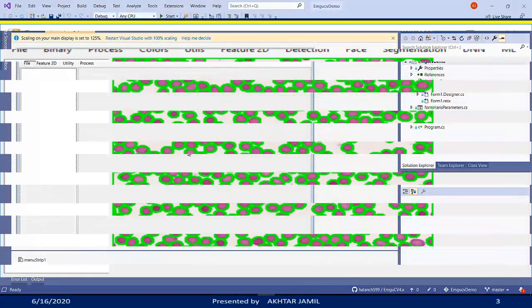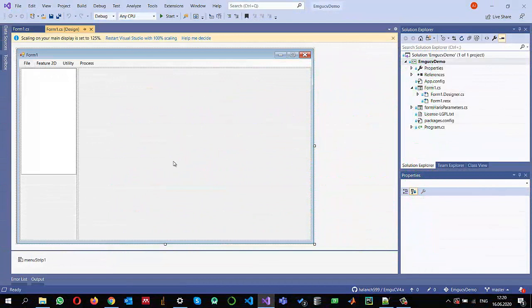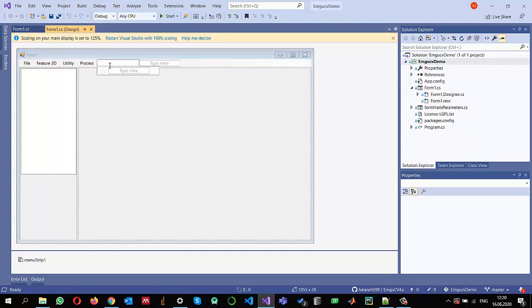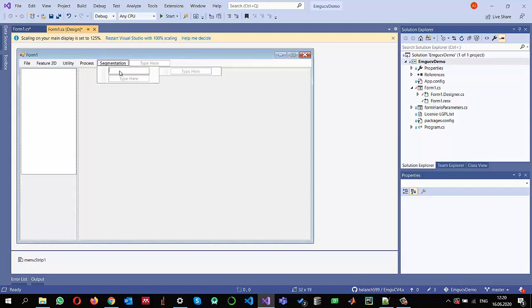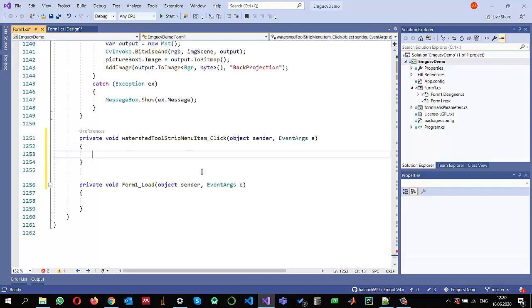I have already configured a project that uses EMGU CV 4.2 — you can check my previous videos on how to configure it. Let me go to the menu item and add a new item. I'll name it 'segmentation' and inside segmentation I will be using watershed segmentation.